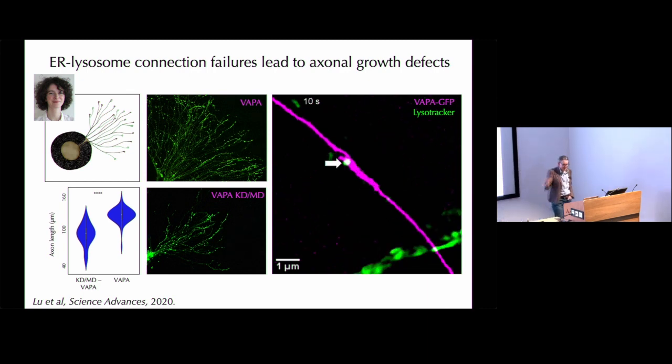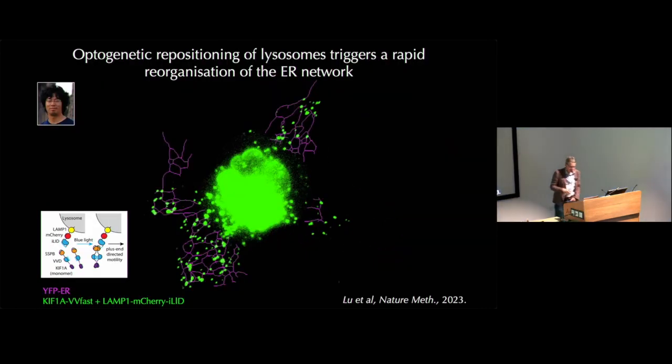So you can see that mechanism has plausibly a connection to maintaining ER health. To test this mechanistically, the lysosomes being the active driver of ER dynamic topology.